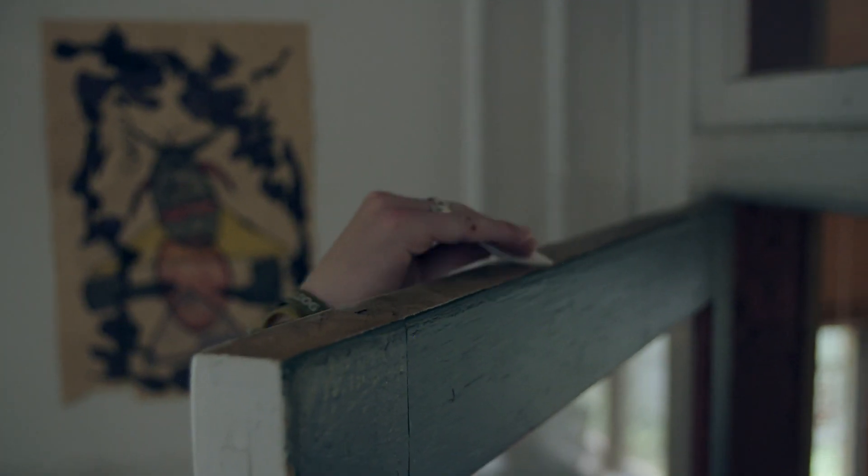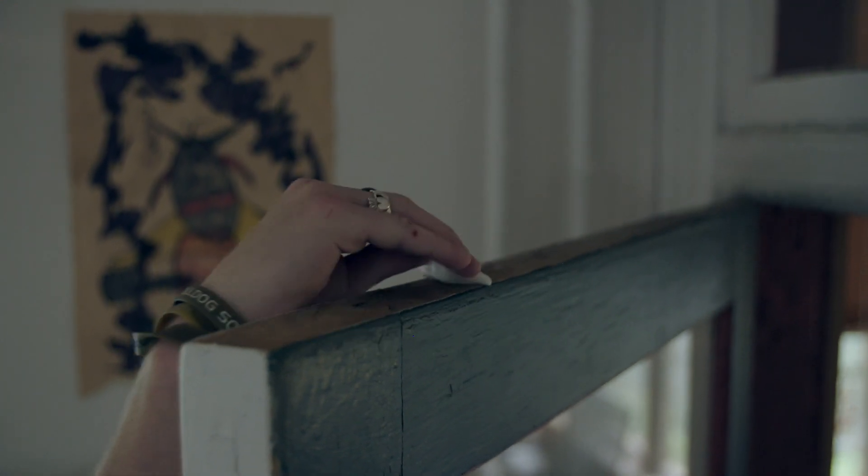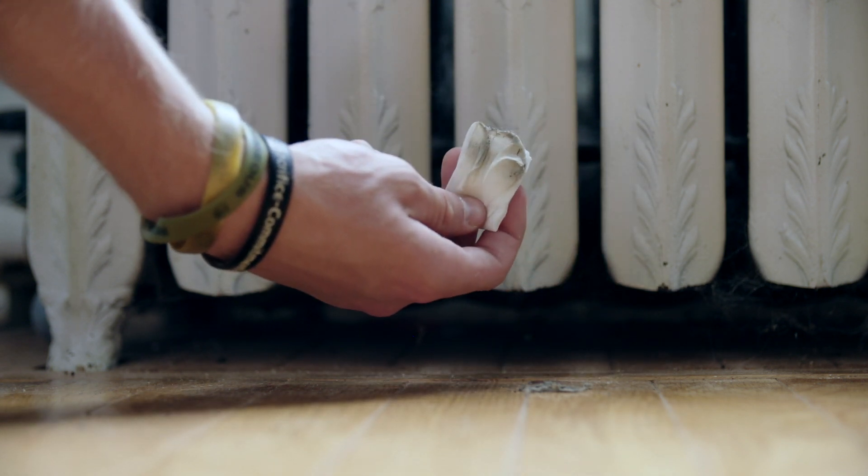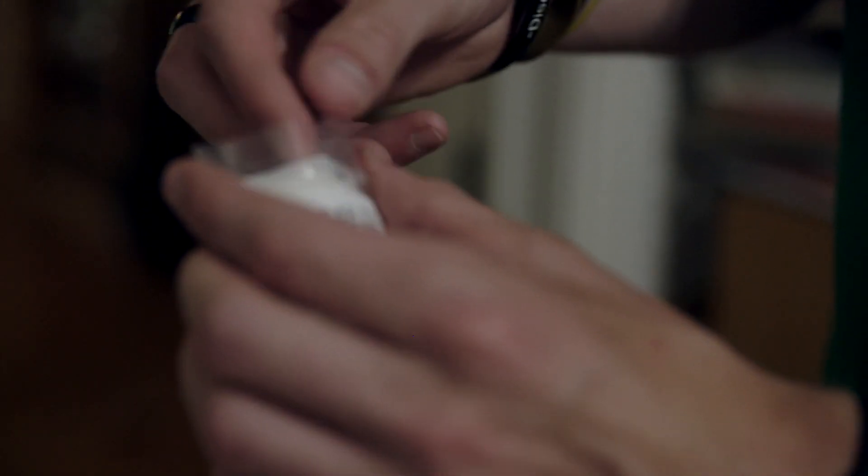Now for sample two. Wipe a surface that isn't cleaned often, like a ceiling fan or the top of a door. Wipe a number of surfaces if you need to get a visible layer of dust on your wipe. Then slide it into the second bag.